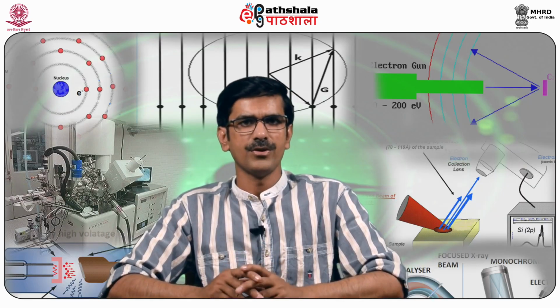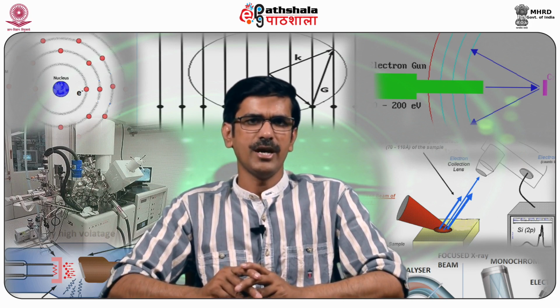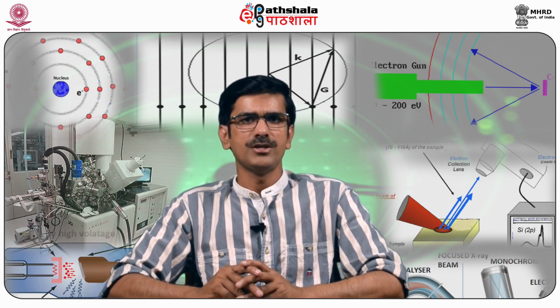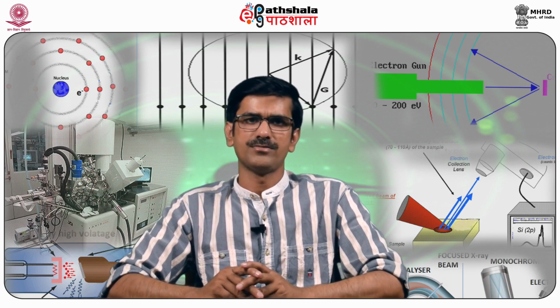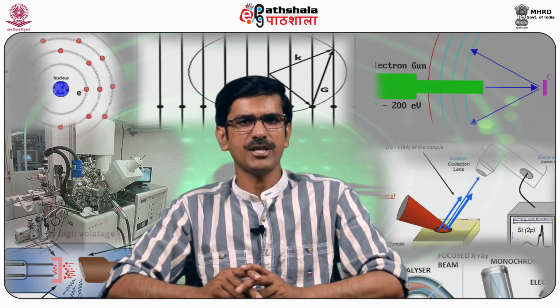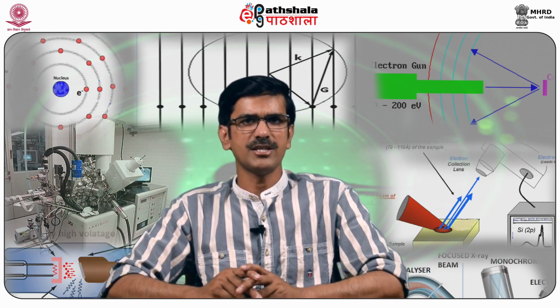Now the gases. One of the main problems in studying gases is that a high pressure is desirable in the region of ionization in order to obtain reasonable signal strength. At the same time, the pressure should be sufficiently low so that the electron does not suffer a collision, particularly an inelastic one, between the time it is ejected from the atom or molecule until it strikes the detector. This is accomplished to a large extent by the differential pumping that is afforded by the entrance slit.